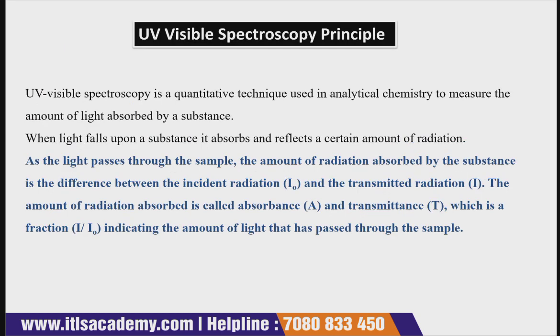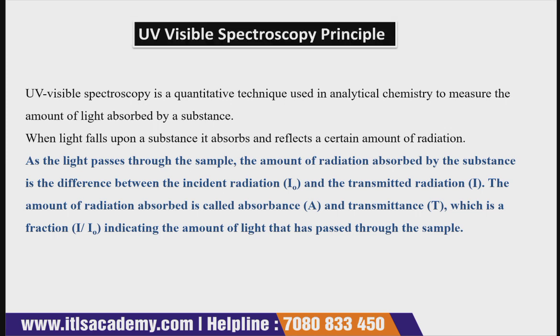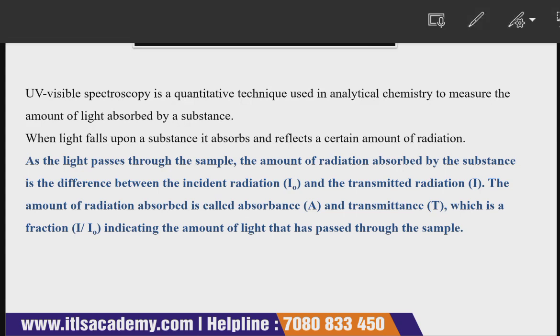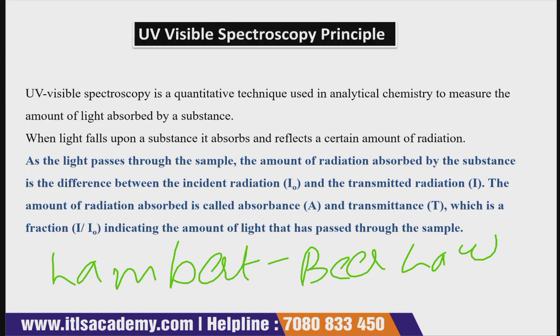Now we will discuss the principle of UV visible light spectroscopy. As I have already told you, this type of analytical technique is based on which law? I'm just writing here: Lambert-Beer law. So the principle of UV visible spectroscopy is based on the Lambert-Beer law.